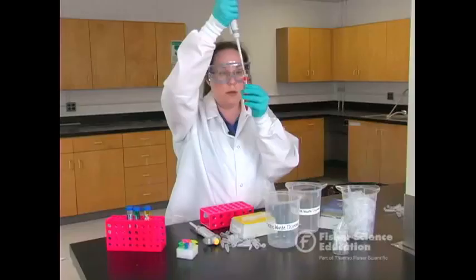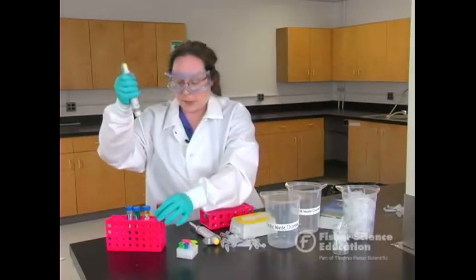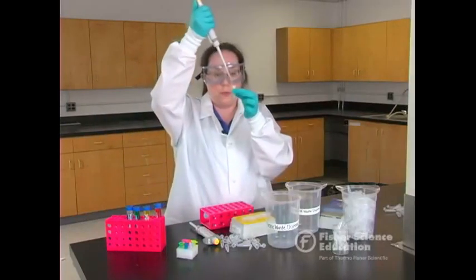The tip needs to go just under the surface of the liquid, and at eye level, slowly raise from the first stop up. Okay, training your students to always recover their samples before pipetting into a new tube.